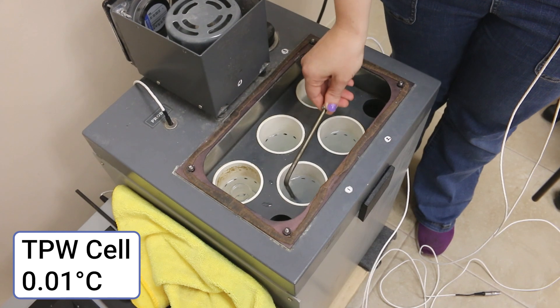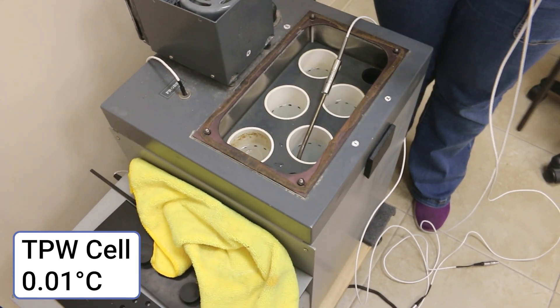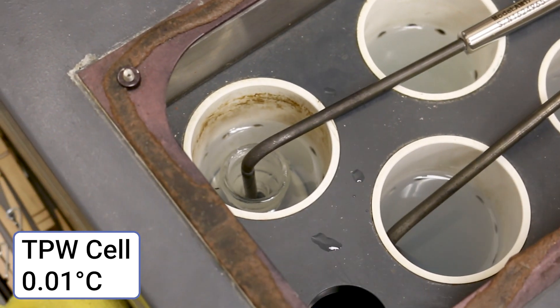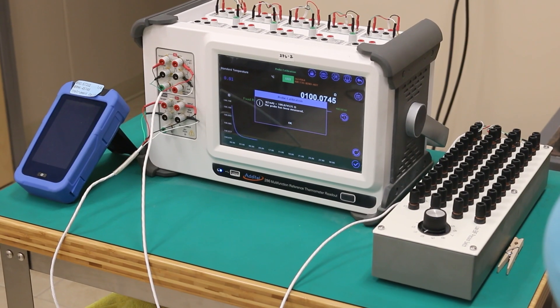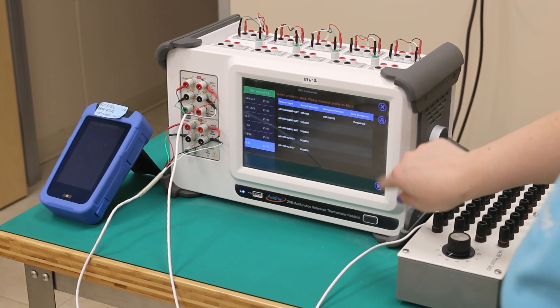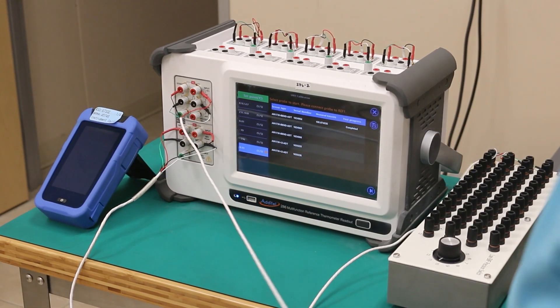Finally, the DUT probes will undergo one more triple point of water measurement. This will be done using the exact same procedure as previously shown in the video. In the final calculation, both triple point of water values on each probe will be averaged to ensure the probes are functioning normally across both ITS-90 sub ranges.